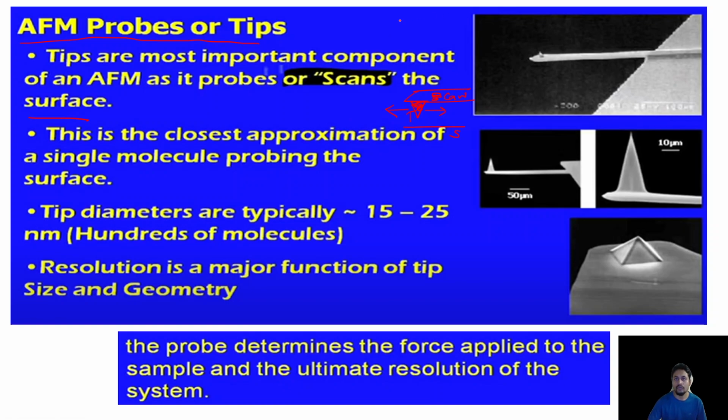And we know, if we look at the force with respect to the distance between the tip and the sample, right? At first, let's say one atom is there, and the other atom is coming from infinity. Whenever it is at infinite distance, there is no attraction or repulsion, so the force is zero. After a certain distance it starts interacting, and it will attract.